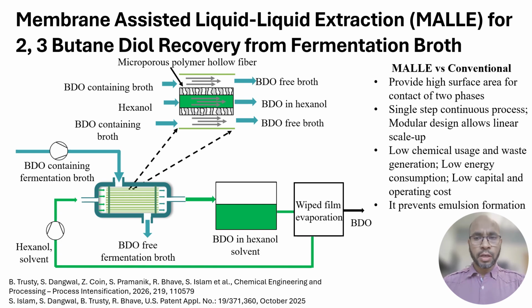In this video, I'm going to talk about membrane-assisted liquid extraction for 2,3-butanediol recovery from fermentation broth. What is 2,3-butanediol? 2,3-butanediol is a chemical precursor that is used to produce various chemicals and also as a sustainable aviation fuel.